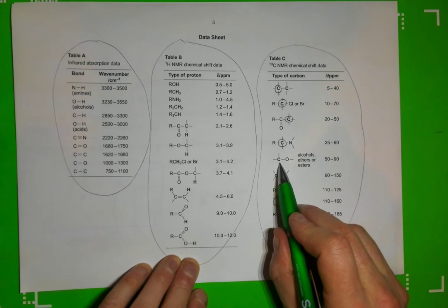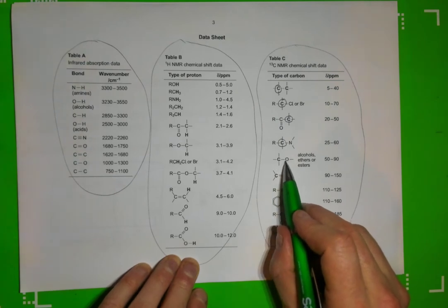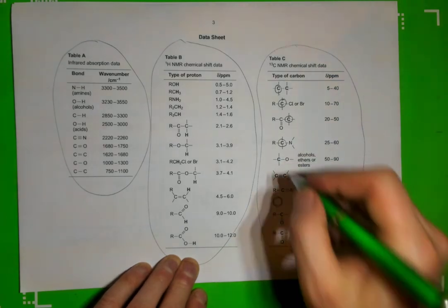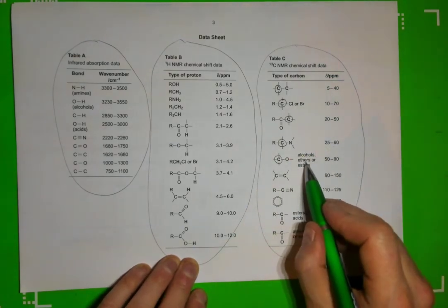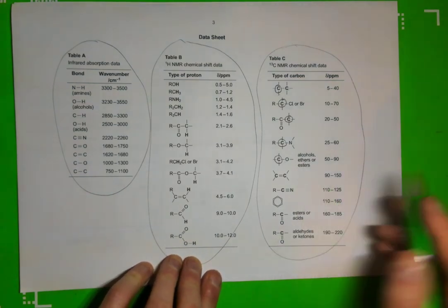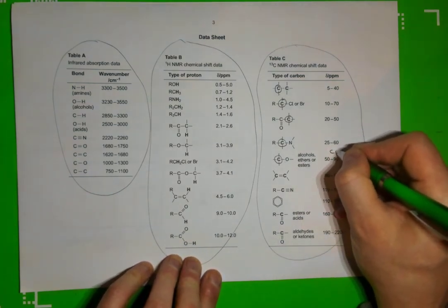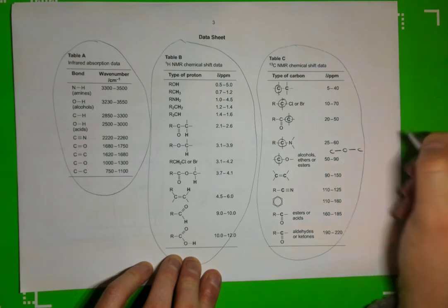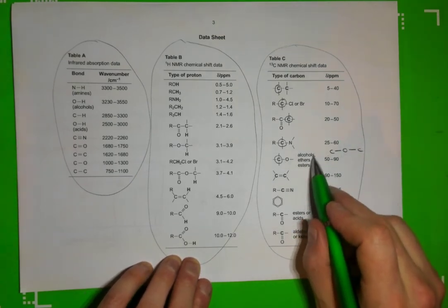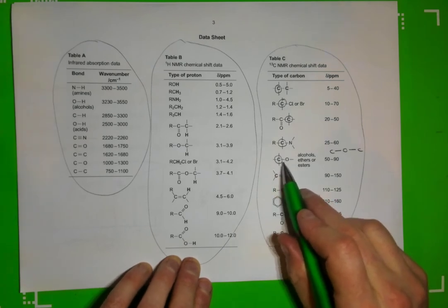This carbon here has a single bond oxygen come from it. So that must be an alcohol, an ether, or an ester. Now, we don't cover what ethers are at A-level, but I'll give you that just because it's written there. It's where you've got a carbon and then an oxygen and then another carbon. That's what you call an ether structure. We know what an ester and alcohol is. You'll have a carbon-oxygen single bond.